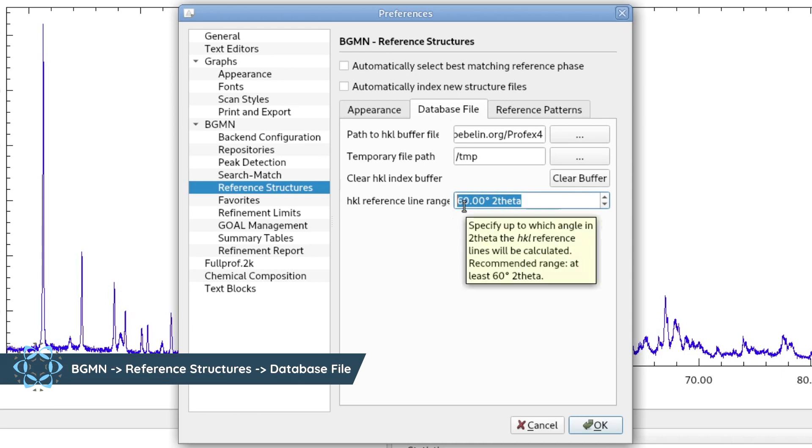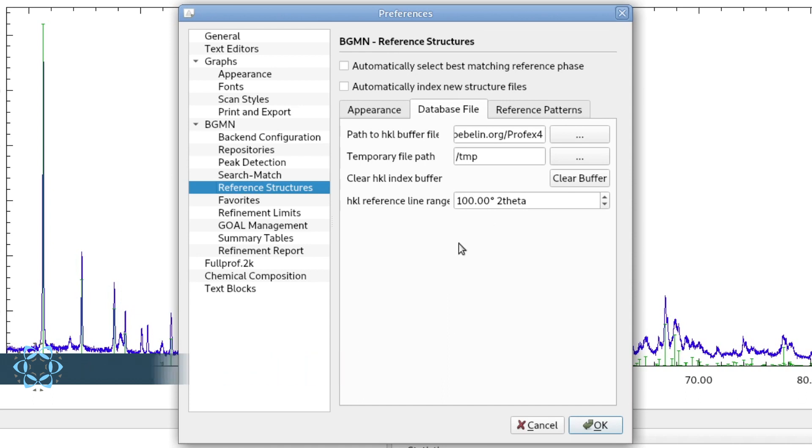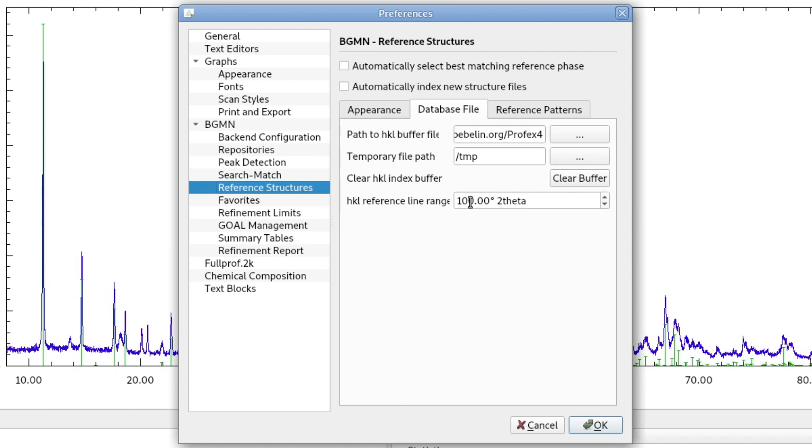We can, for example, go up to 100 degrees. This angle actually refers to copper radiation. So what it does is it indexes the structures up to the D value at 100 degrees using copper radiation. If you are using a different type of radiation, it will still go up to the same D value.